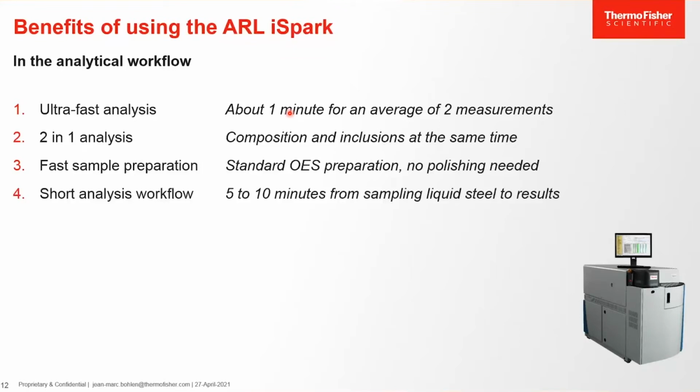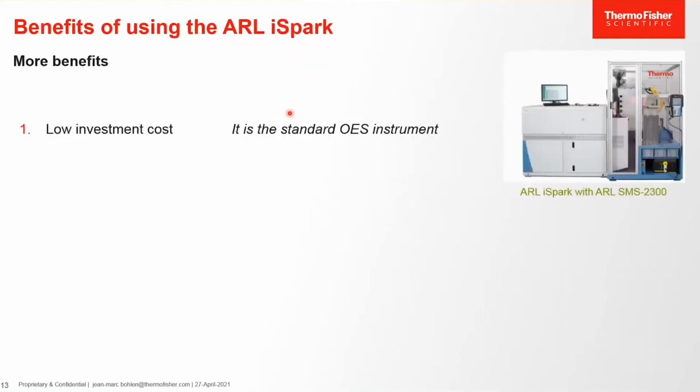Overall, the analysis workflow is short. It takes 5 to 10 minutes from sampling liquid steel to obtaining the results. And a high throughput of sample analysis is possible because optical emission is very quick. Hundreds of samples can be analyzed typically per day.